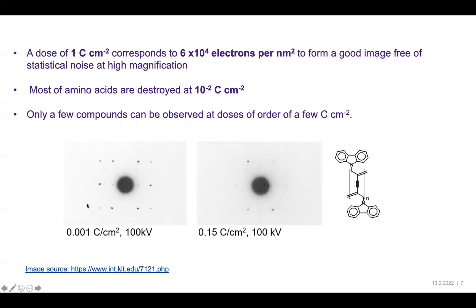Here is a polymer sample at 100 kilo electron volts at extremely low electron dose. As the dose is increased, you can see the sample gets damaged. This is a nice example of how electron dose and beam damage affects samples.